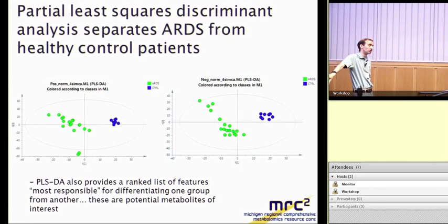So yeah, that's something you certainly should be aware of, and it may be a little bit of an artificial thing that we did by even attempting to map it onto a pathway. But I think as a means of analyzing data, even in complex scenarios, we should be cautious to say that by putting things on a pathway, we're not trying to prove a mechanism, right? Or at least that's not always what we're doing. We're not trying to say rate of metabolism is X. We're just trying to visualize connections between changes in the overall metabolome that we're looking at. To do the more detailed flux analysis and directly prove a mechanism is a much more elaborate process.